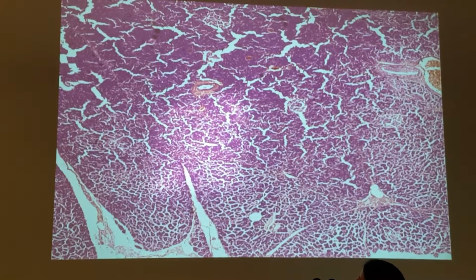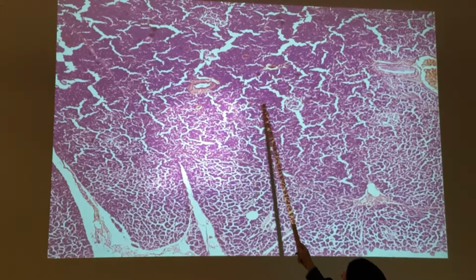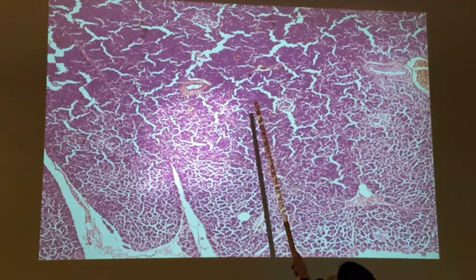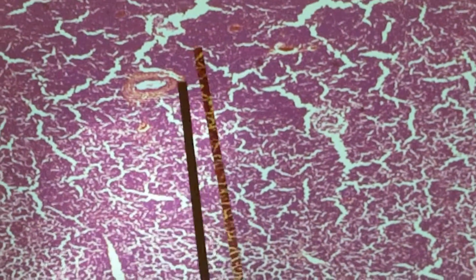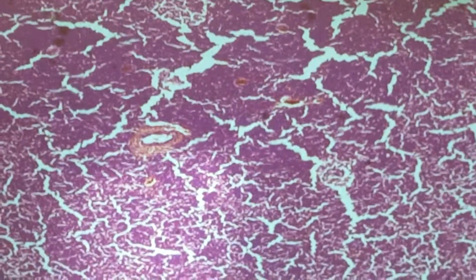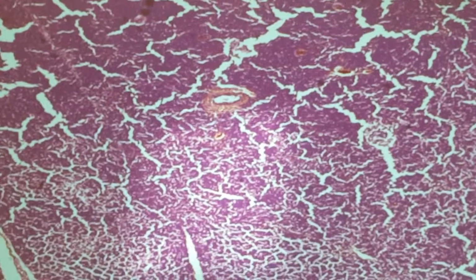Okay, so, still rough. So the acini, pancreatic acini, here's an islet of Langerhans. It looks so much better through your scope than it does up there. That's another one. Got it there. And then this, again, circle of cells would represent a duct, so the pancreatic duct.